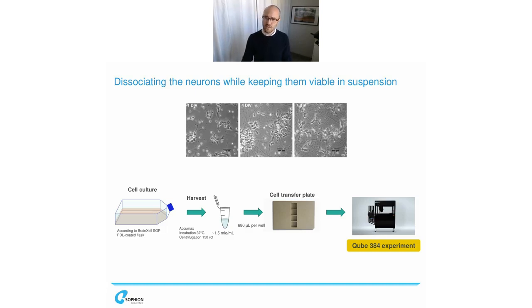And if we then want to use these cells on our automated patch clamp platform, one requirement is to lift the cells into a single cell suspension. And really, that's the critical step. If you're working with both these technologies together, that's the step that typically requires most optimization, because you want to assure that you have this very clean single cell preparation where there's no debris or membrane fragments floating around that may prevent you from getting that giga-ohm seal resistance.